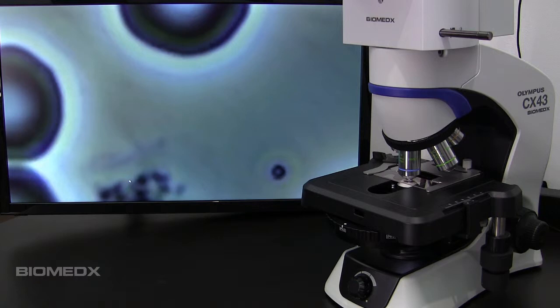Again, I have to stress we are looking at this with only a 40x non-oil objective. If needed, you could move to a 100x oil objective and more than double the magnification over what we see here along with increased resolution if it were needed.